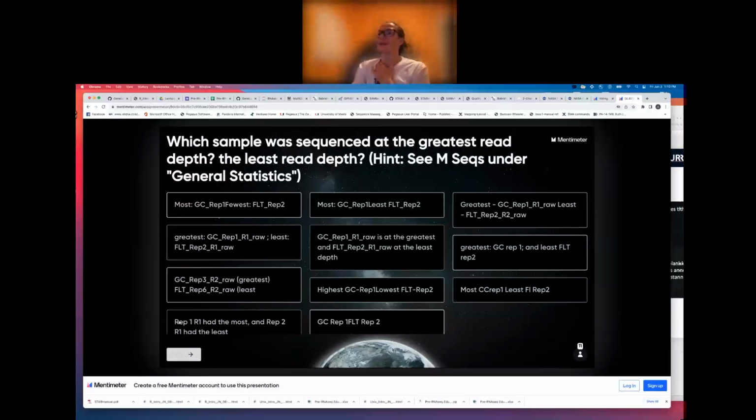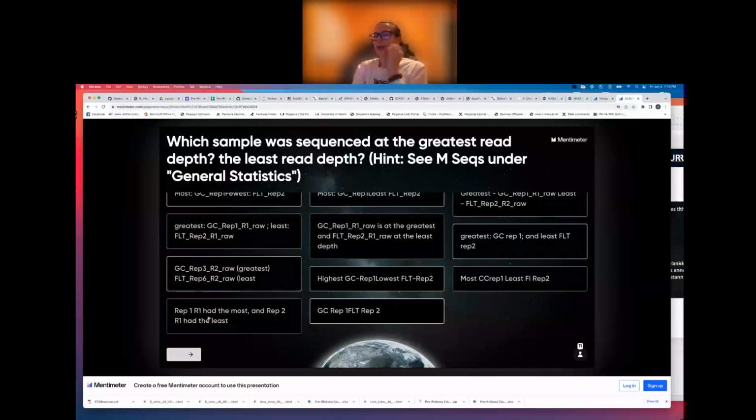Okay. So just to point out, this person who did the R1 and the R2: what should the number of reads be in the forward and the reverse samples, or the forward and reverse FASTQ files? What should the total number of reads be for forward and reverse? You put that in chat. Same, different? So the total number of reads in our forward FASTQ file and in our reverse FASTQ file, should they be the same? Should they be different? Yeah, Chief, they should be the same. Why? You can unmute your mic.